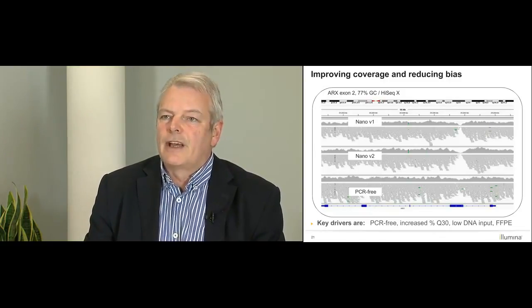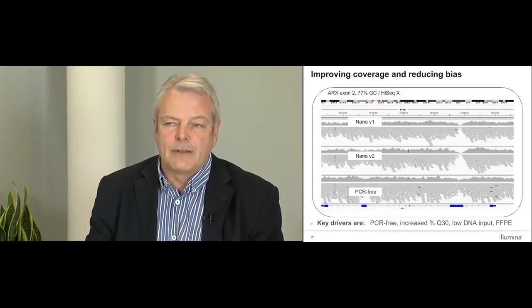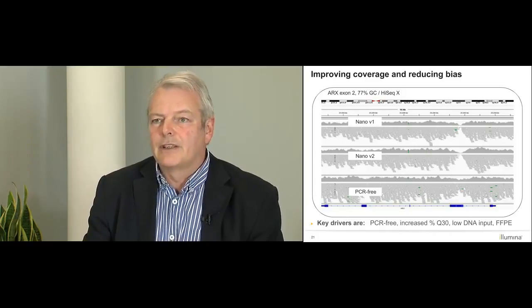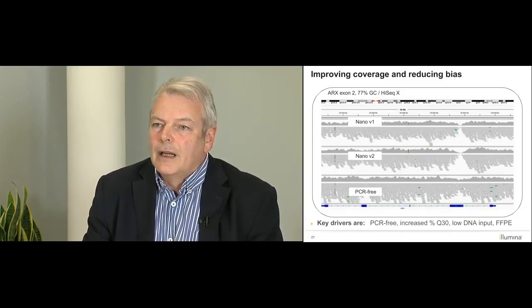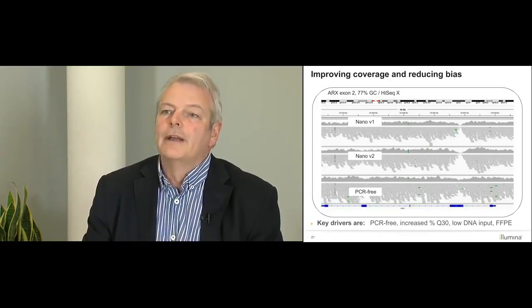And so you can see the effect of just looking at these very small points in the genome, which may be medically relevant and are also very important to actually assess how well they are represented in the whole genome. They are all part of making a whole genome, or other methods, really tested and able to provide the information that is really required in the clinic.